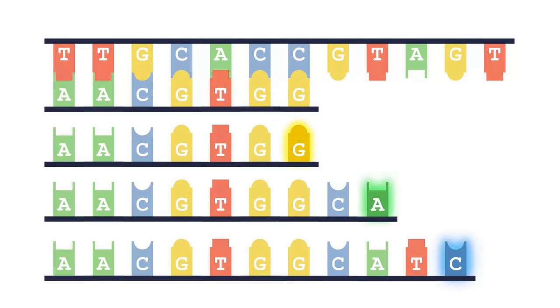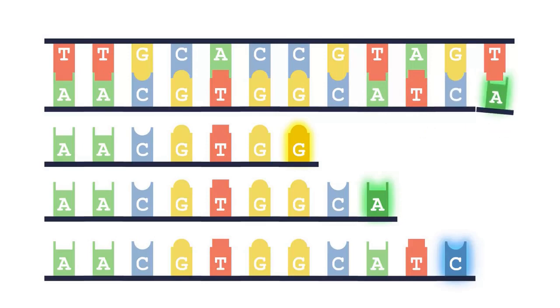Because millions of strands are created in a PCR procedure, multiple fragments of every length will be created. The result is that each DNA fragment created is a specific length and always ends with a fluorescently tagged nucleotide. When we remove our PCR product from the thermocycler, we have a mixture that contains millions of DNA fragments of all different sizes. So how do we separate different sized DNA fragments?